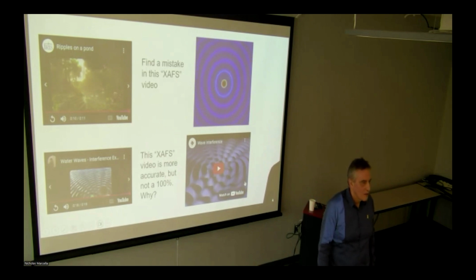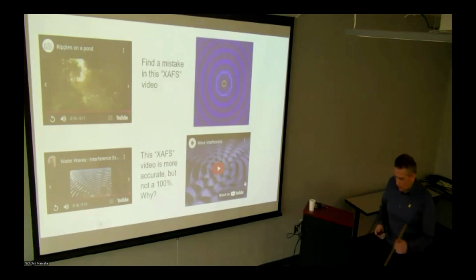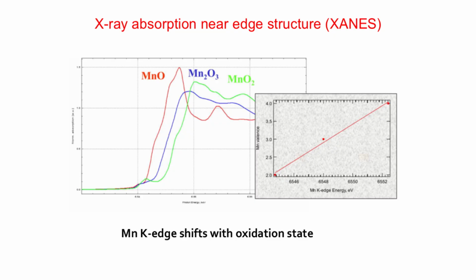Yes. Sometimes we can tell the oxidation state by XANES, but I don't know why. So yes, the absorption coefficient rises at a certain energy. Suppose that you want to compare two materials in which one element is the same, but in one material it's more oxidized, and in the other it's less oxidized, or more reduced. The absorption coefficient in both of them will not be identical, but in one of them it will start at lower energy than in the other. So basically the onset of absorption will occur at different energy.